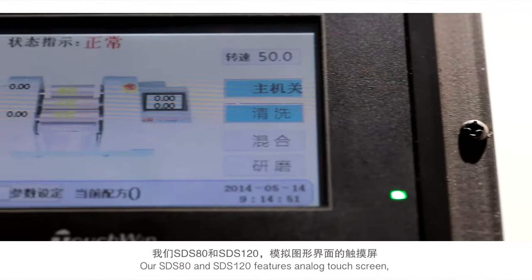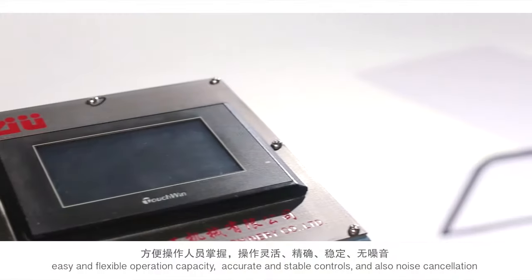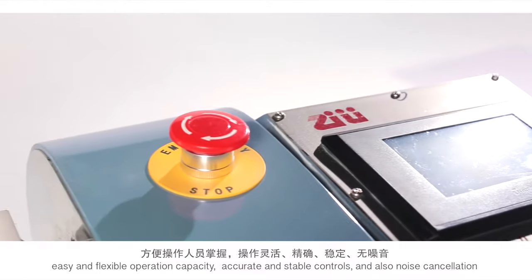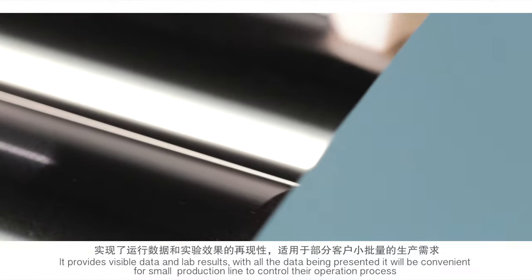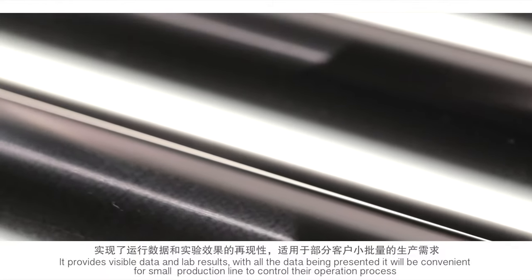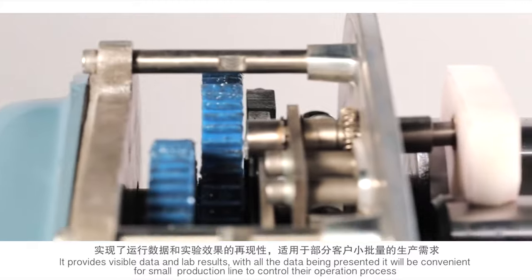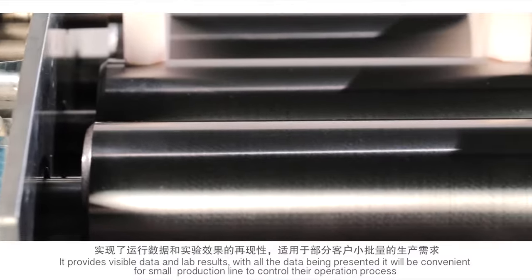Our SDS 80 and 120 feature an analog touch screen with easy and flexible operation, accurate and stable controls, and noise cancellation. It provides visible data and lab results, and with all the data being presented, it is convenient for small production lines to monitor and control the operation process.